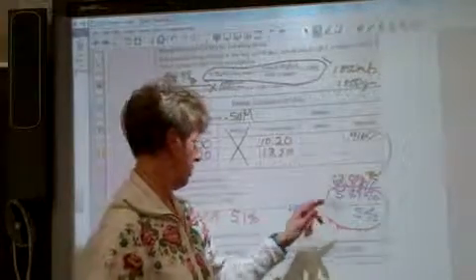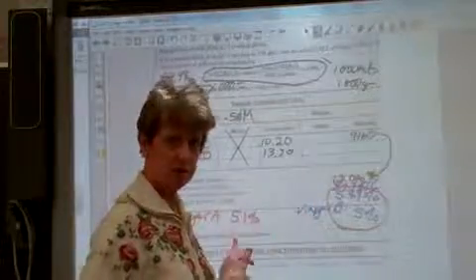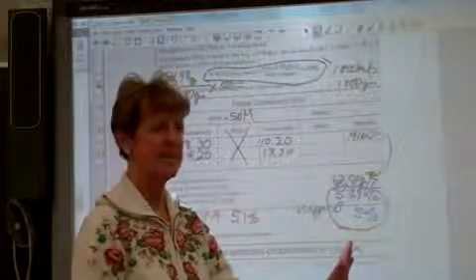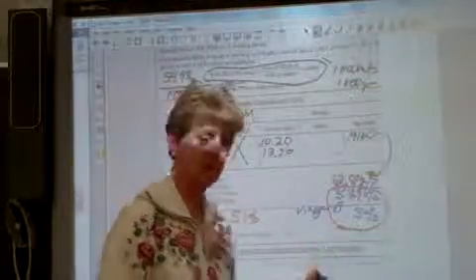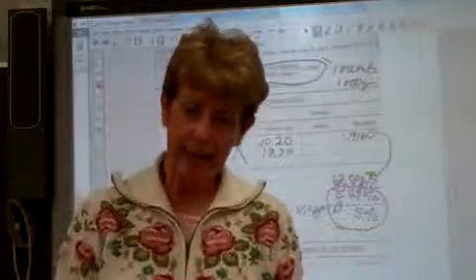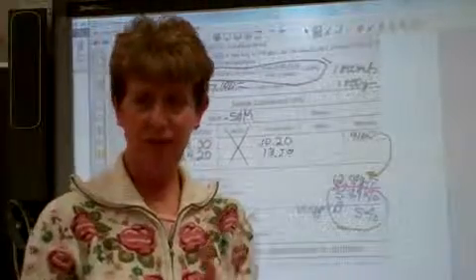Reflection. Restate your purposes in the reflection. Calculate your percent error, vinegar A or vinegar B. And then if it's less than 10%, which we've had a lot of good numbers here, you move on and give suggestions for improvement. If it's greater than 10%, I need some explanation. What went wrong? And once again, suggestions for improvement would include a discussion of what could be better in this lab. And again, would you also just jot down your thoughts and your reflections here?